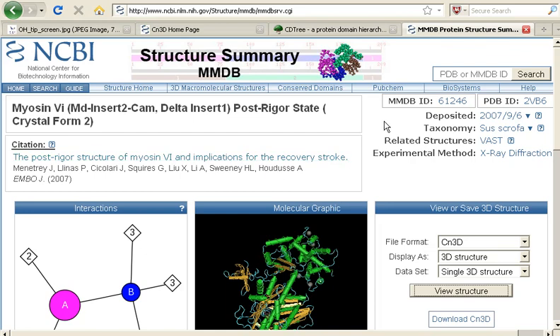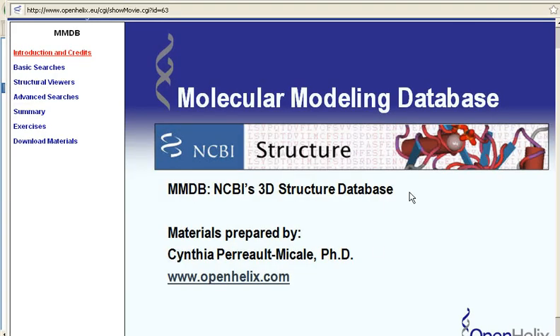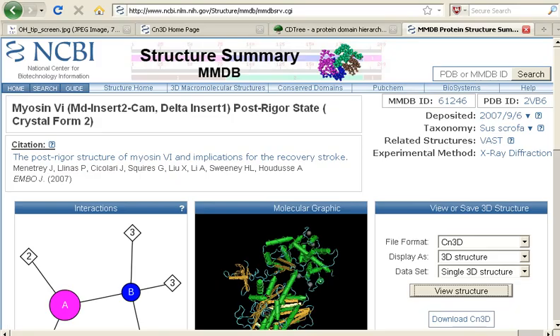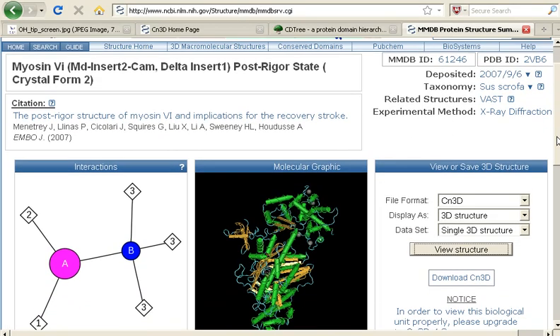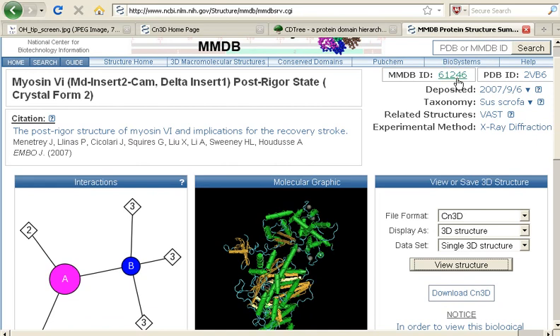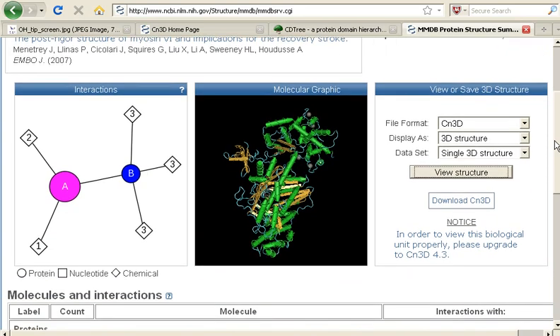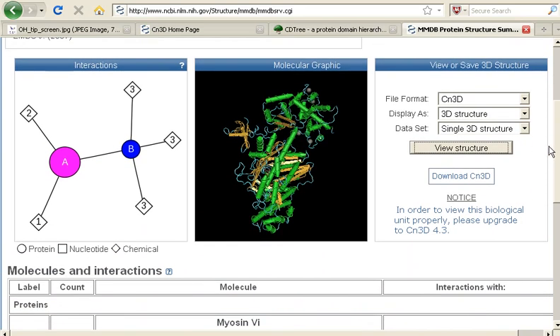Right now, I am showing you a structure summary page from the MMDB resource for Myosin 6. If you view our full MMDB tutorial, we show you exactly how to get to this page and what it includes. What I want you to know now is that we are at MMDB ID 61246, and on that structure summary page, there is an area with a molecular graphic of the structure, and I can click to view that structure with the CN3D software.